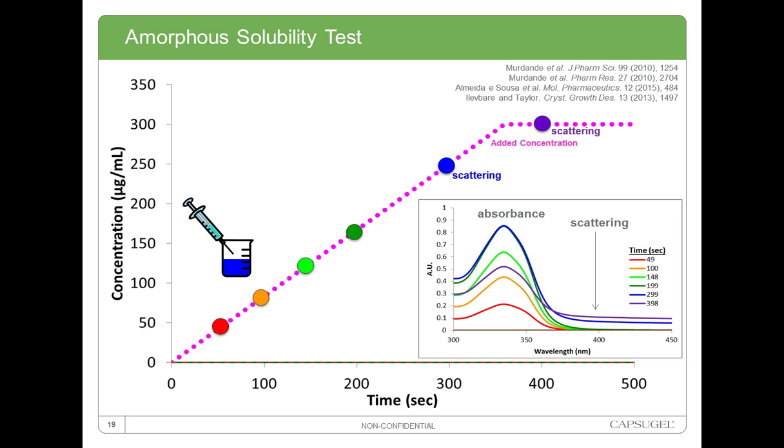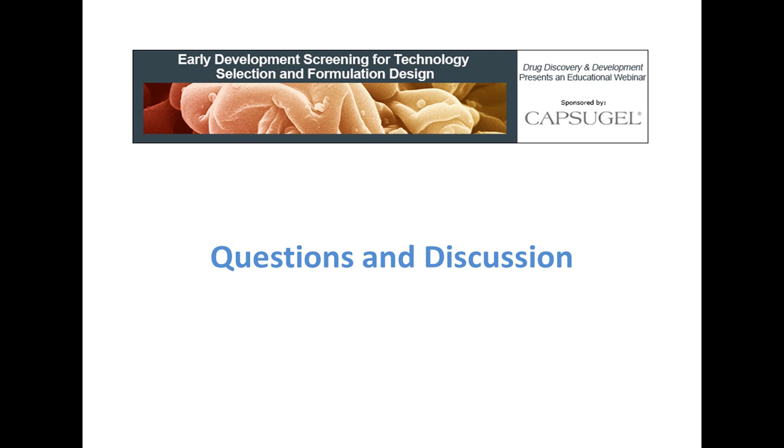Okay, thanks, Michael. Our next question, you showed an increased sustainment on gastric to intestinal transfer for erlotinib with VCAPS plus. Is this a general phenomenon?